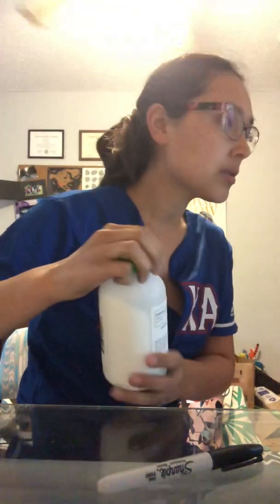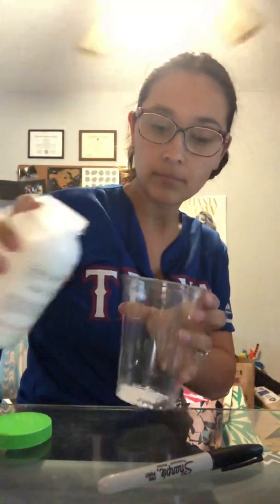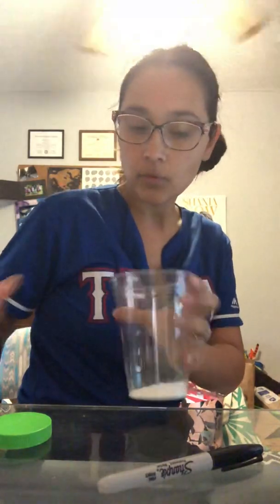Okay, so first we have to observe the different things that we are going to be mixing. The first thing is, I believe, calcium chloride. Yep, calcium chloride. I'm going to pour a little bit in here. So calcium chloride, you can see it's white and powdery.